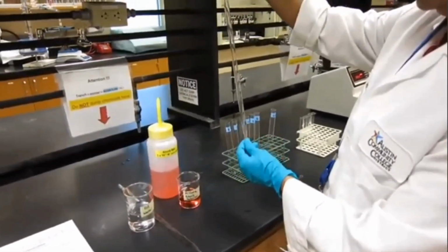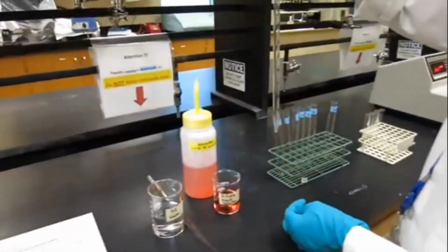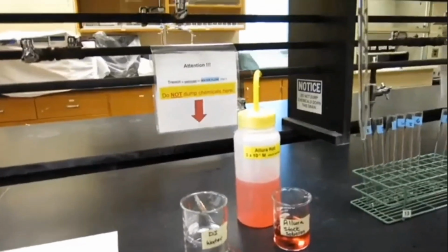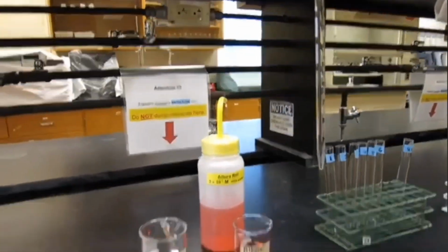So you saw what we need. We need an Allura red stock solution. We need pipettes. We need test tubes. And we also need cuvettes.